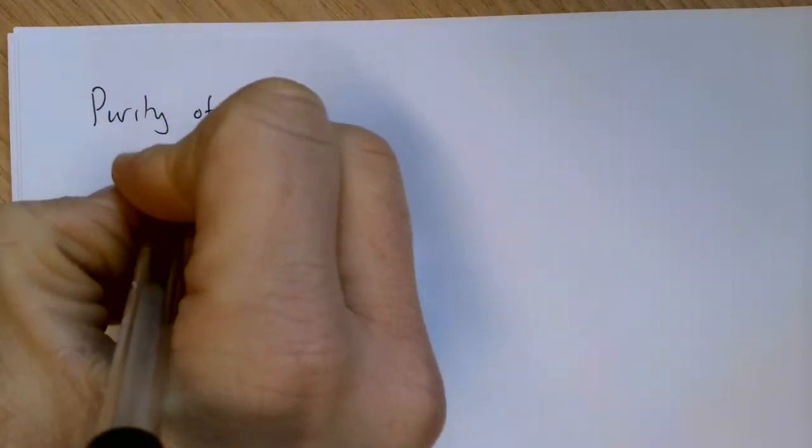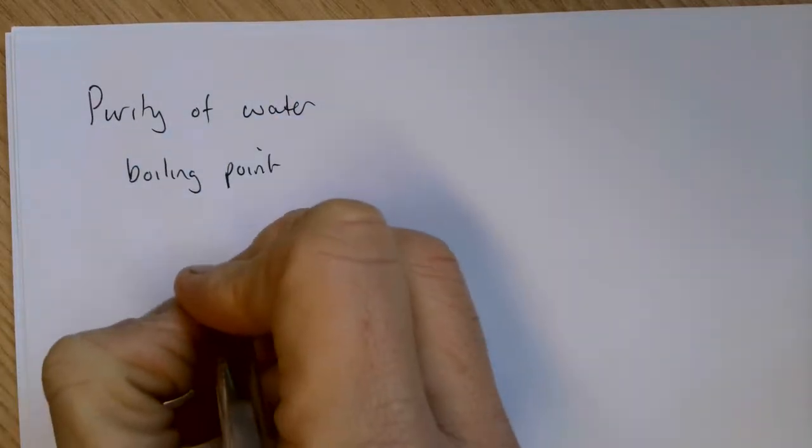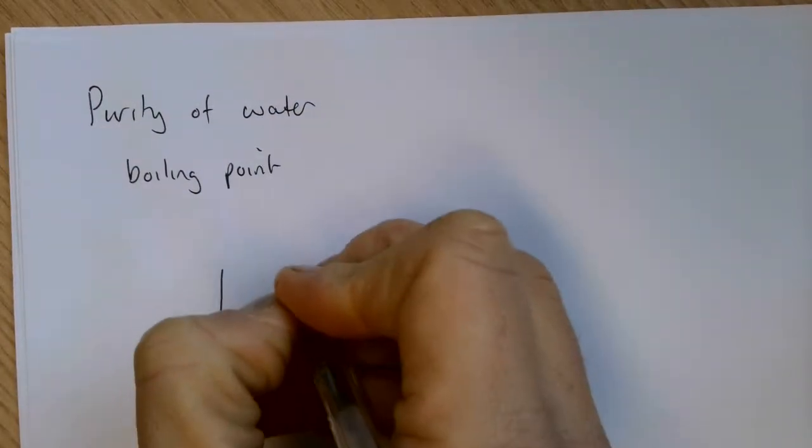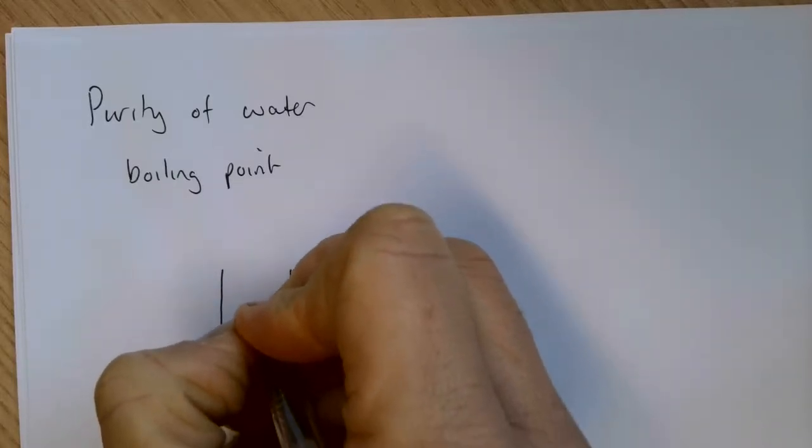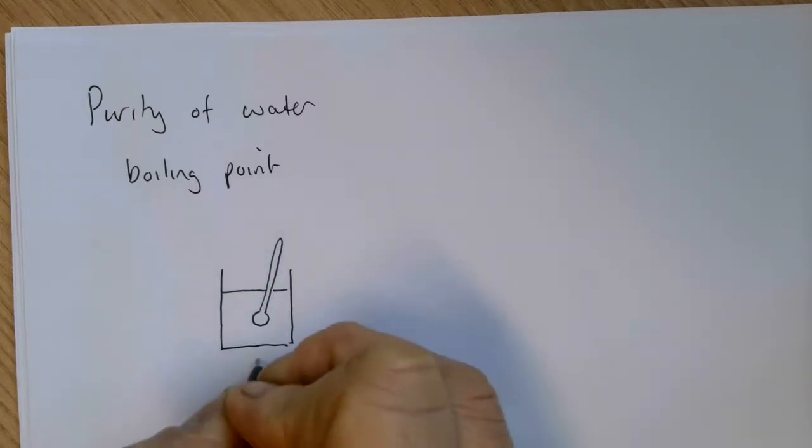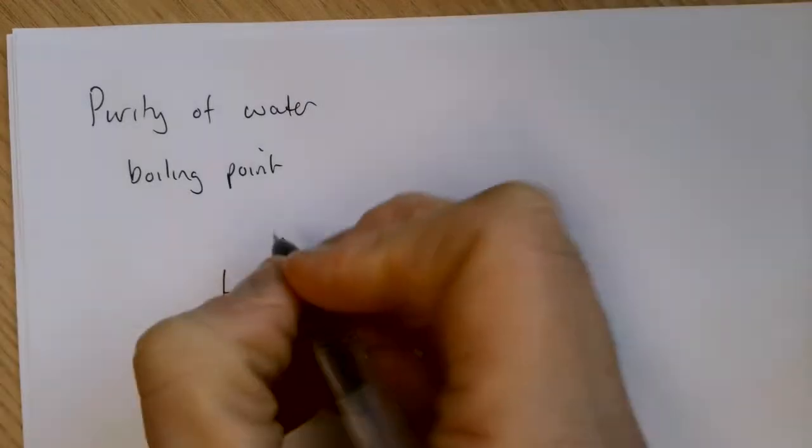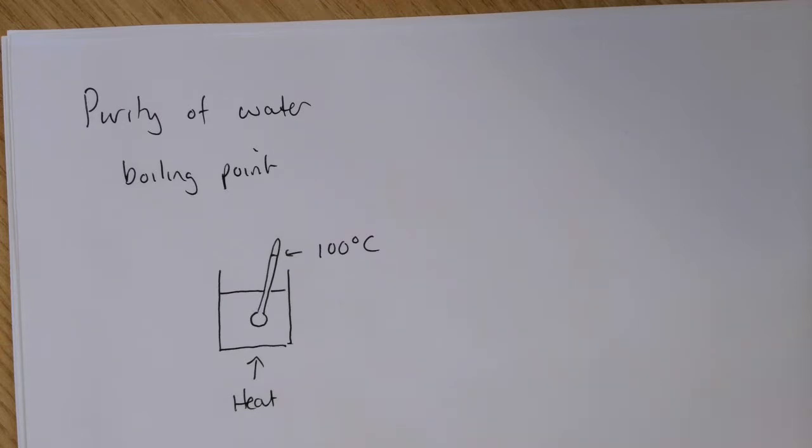One of the simplest ways to find out if water is pure or not is from its boiling point. In reality, this practical will be quite difficult to do, but theoretically we can take a water sample and place a thermometer in our water sample.